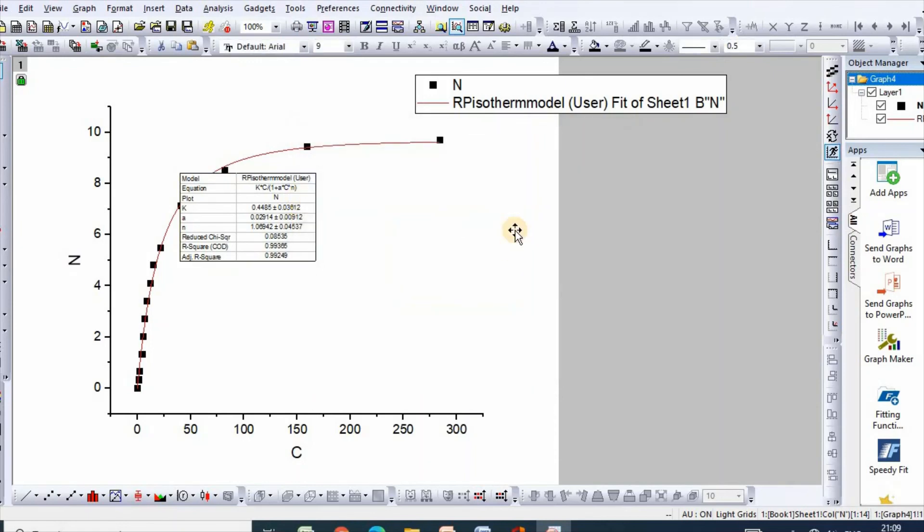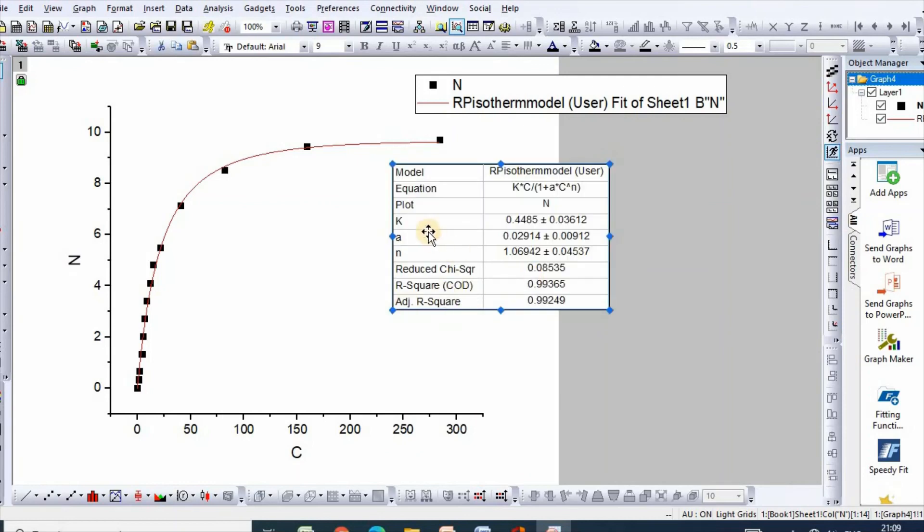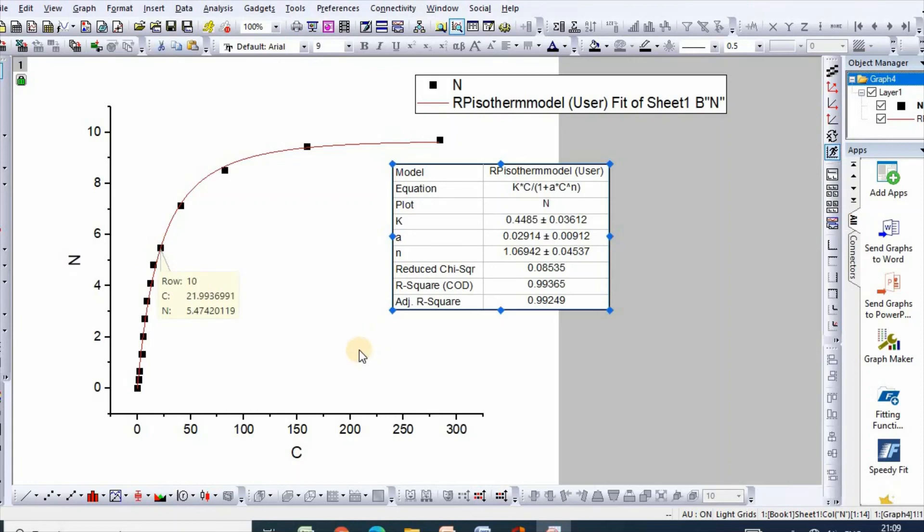There are your RP model parameters, and after some editing you can make it publication quality. This is how we can easily fit Redlich-Peterson model using Origin Pro.